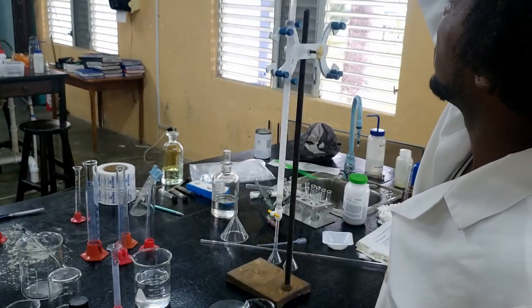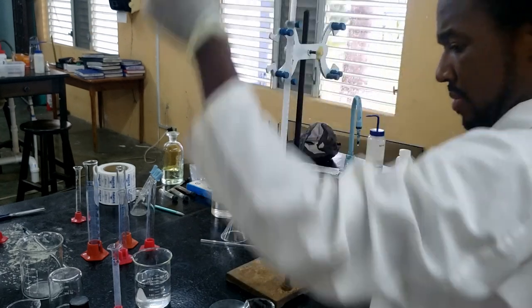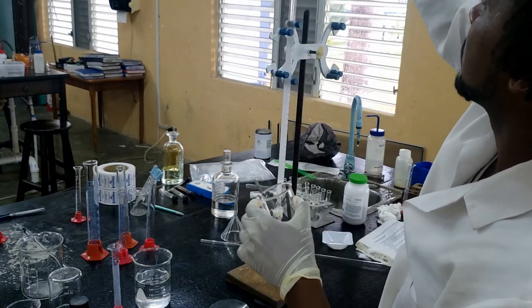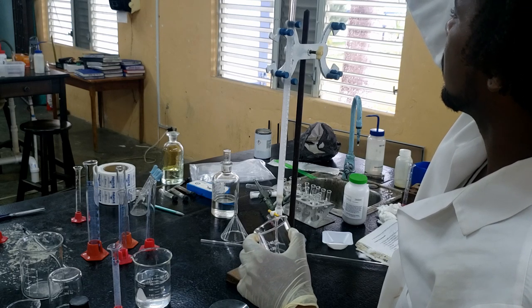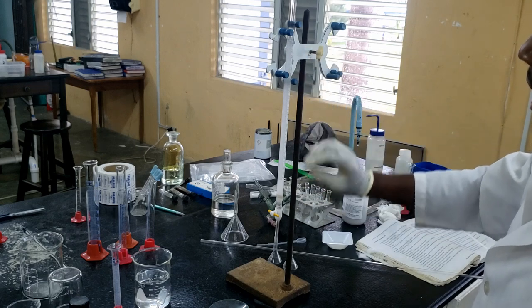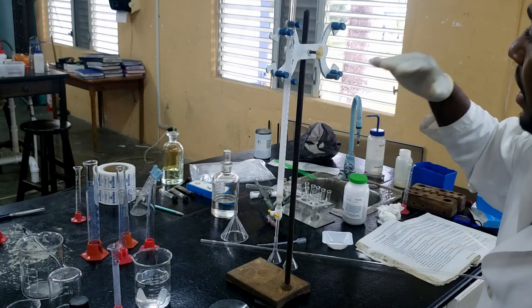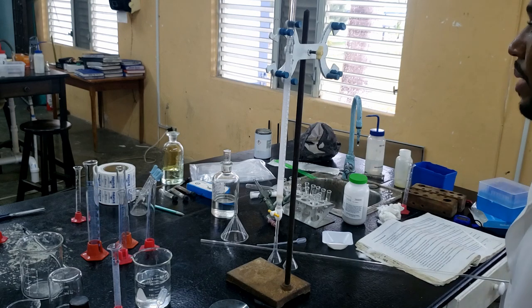Rinse off, make sure everything gets in. Now we're just going to leave this a while so that all the silica can start to settle. Once all the silica has settled, we're going to put another layer of sand on top of that. So just let's wait. Let the silica settle by gravity.